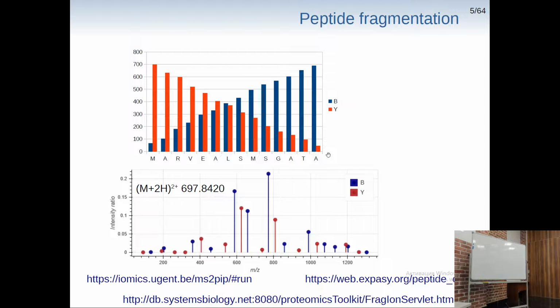And if you have some problems in sequence detection, you can just use different proteases, for instance, to see whether there is this amino acid. There are a lot of proteases, and some of them will cut after the amino acid that you have already identified, but before the one that is not yet identified, right? So you can use information about the selectivity of those proteases.